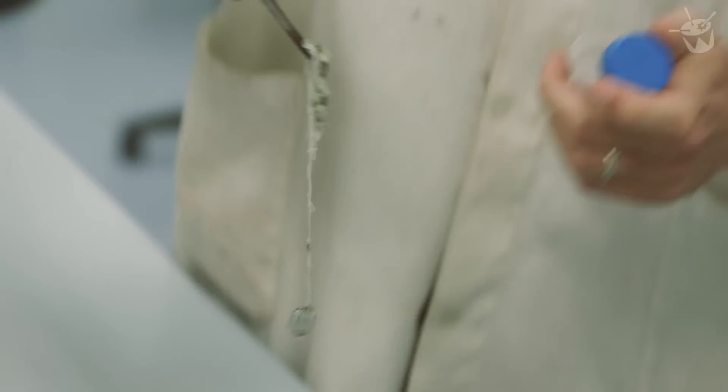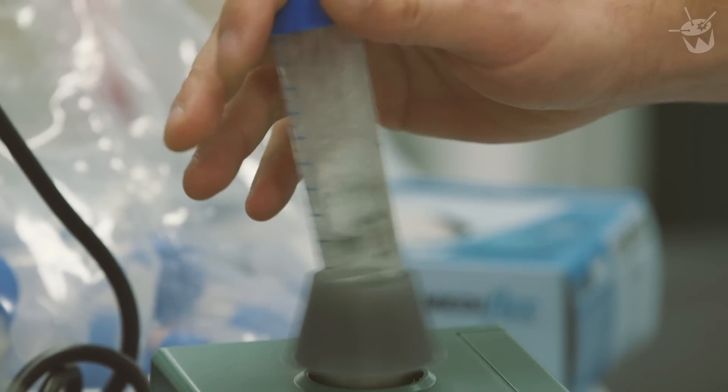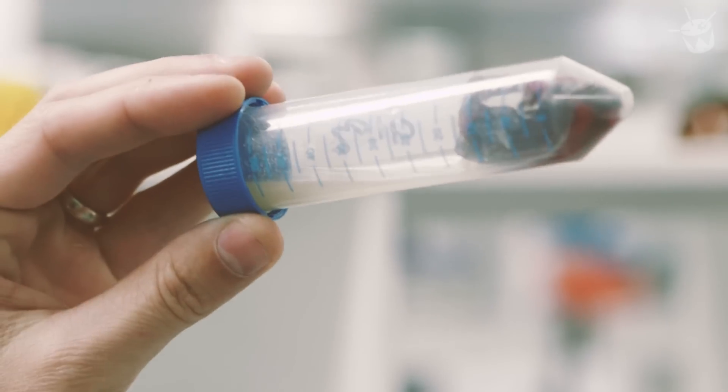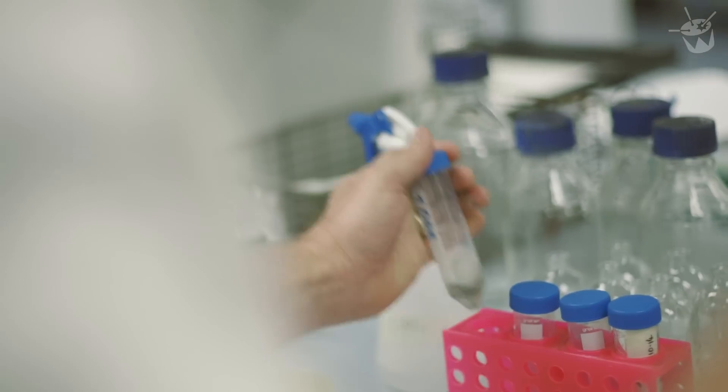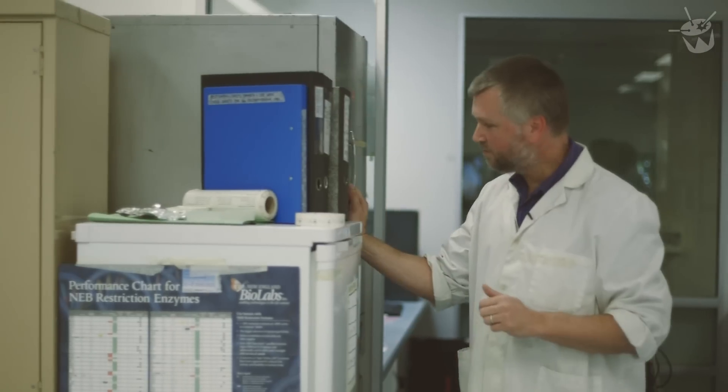So what we're going to do is take the wristband, put it into this diluent — it looks like the tail of a rat or something. We're going to vortex it, which is just shake it around a heap, and that will dislodge the bacteria from the wristband into the liquid. We'll then make some dilutions and plate them out onto these agar plates. These are now ready to go in the incubator, and we'll leave those to cook for a couple of days and see what grows.